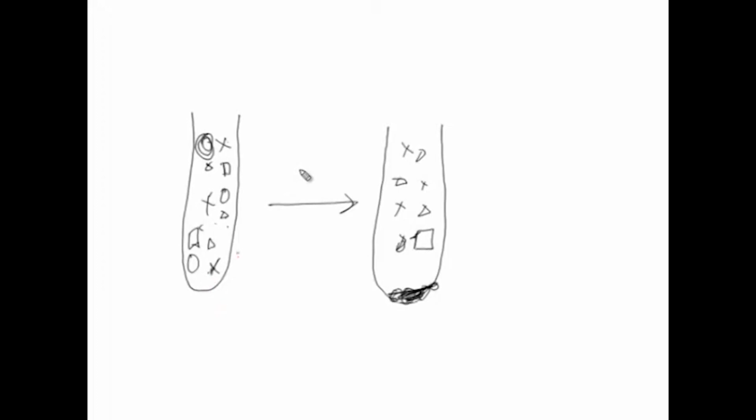The larger molecule will travel down, but the molecules at the bottom will also end up in the pellet. So the pellet might contain a major portion of the larger molecule, but it will also contain other components, because they are distributed across the tube and the one very close to the bottom will also sediment in the pellet. Unless you layer the sample on top, this problem will be there.